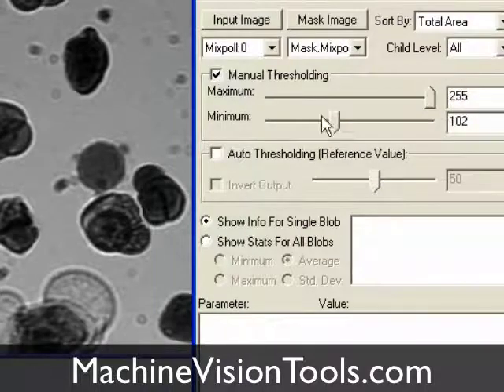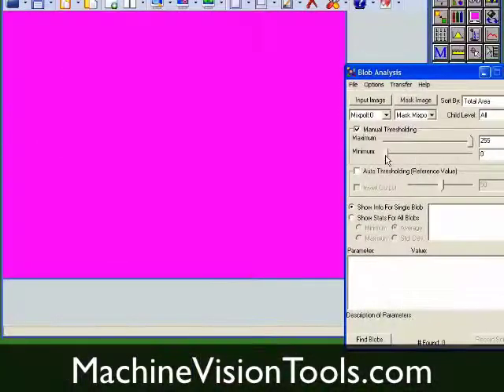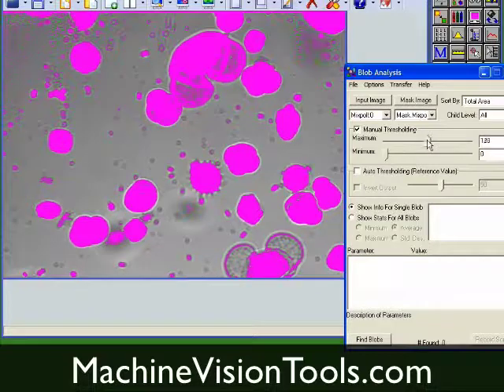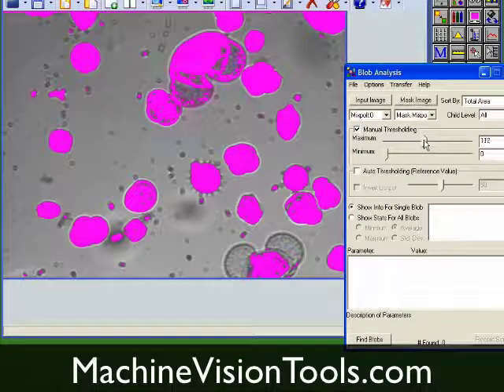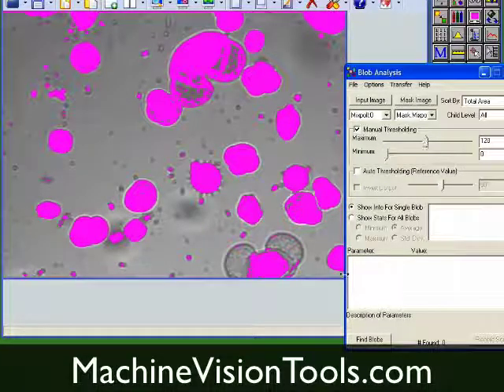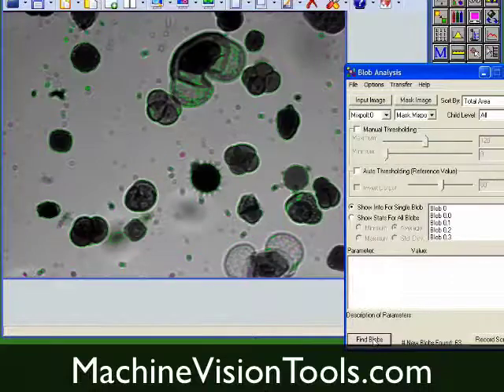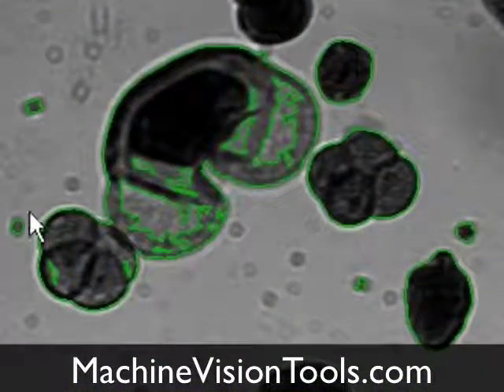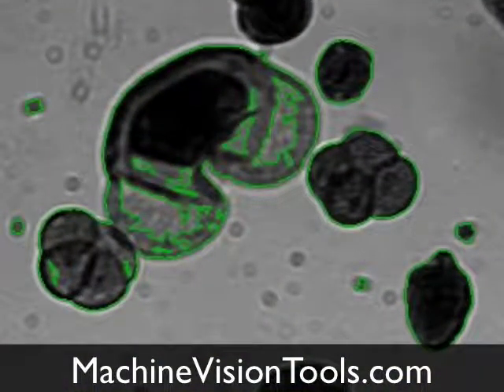With manual thresholding selected, we move the sliders until the image looks the way we wanted. With our threshold set, we'll click Find Blobs, and as you can see, the blobs in the image have been highlighted.